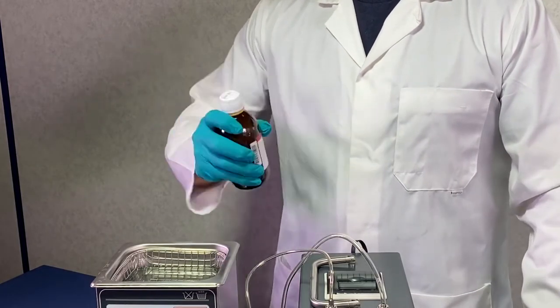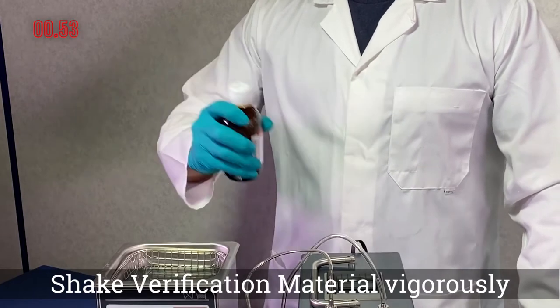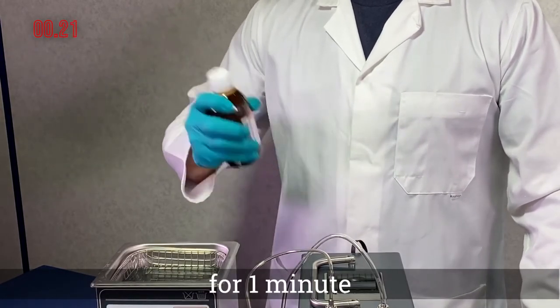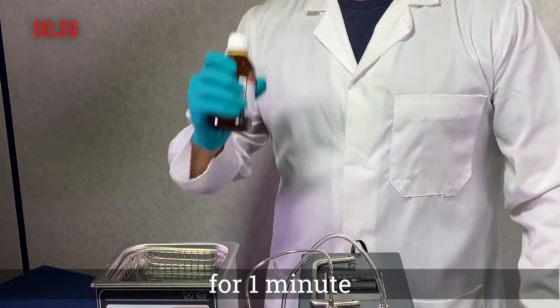Step 1. Vigorously shake the verification material for one minute. It is recommended to use a stopwatch to ensure accurate timing.